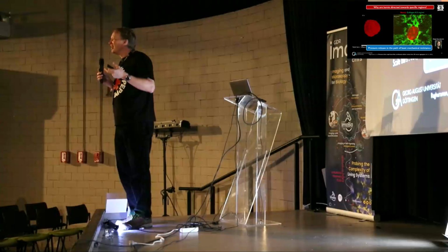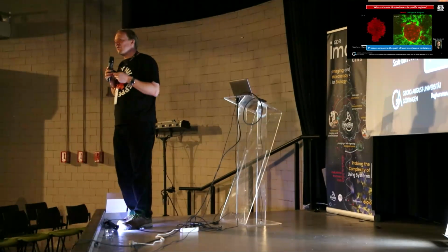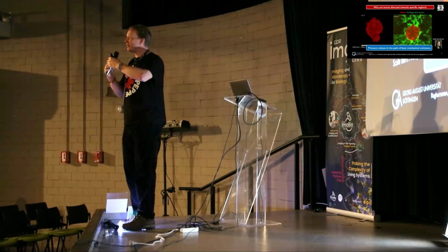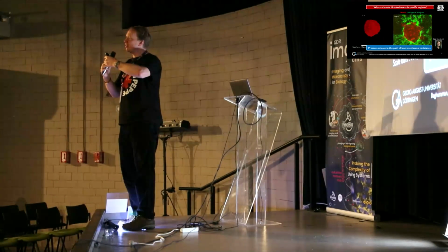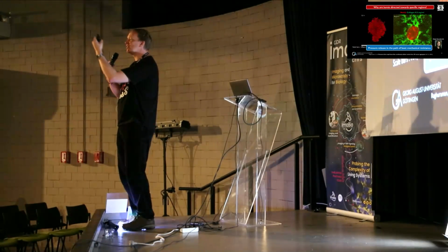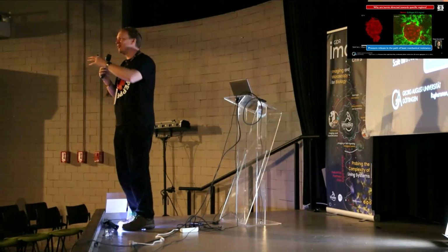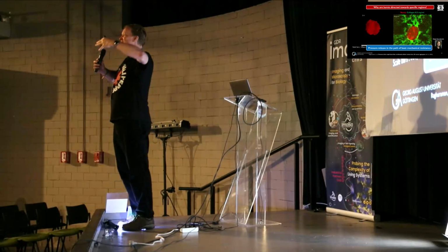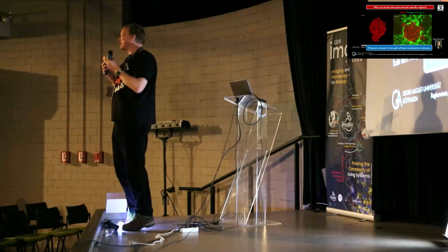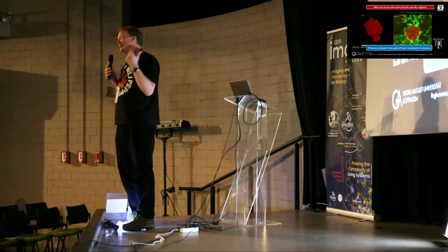Did you model it? Is there a model you think of doing? Yeah. What we think is that we have collagen in there, and we have the receptors triggered. The problem is it's so soft that the cells try to pull on the environment, but there's no resistance, and then they become apoptotic. They're in the wrong environment, they become apoptotic, they swell, and the swelling is what we see here. So from a physics perspective it's still cool, but from a biomedical perspective maybe it's less great. Thank you very much.